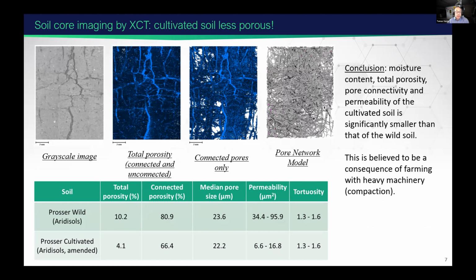are able to provide these image data, the segmented data, as a kind of library or database of soil for the user. And the third is that the segmented pore scale data also provides information, serving as input into reactive transport and computational fluid dynamics models.